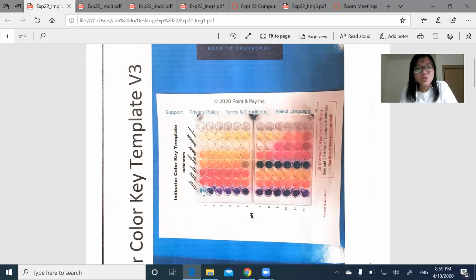So all you have to do is spot a change in color. For example, this one would be methyl orange, I think. No, methyl violet. Yep, methyl violet. The very first change in color would be between pH 1 and pH 2. All you have to do is spot the change in the color across the entire scale from pH 1 to 12.